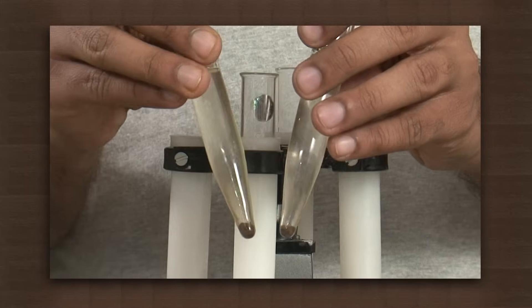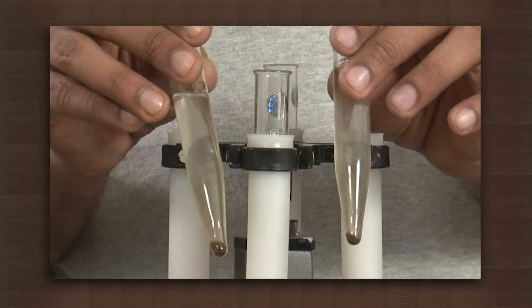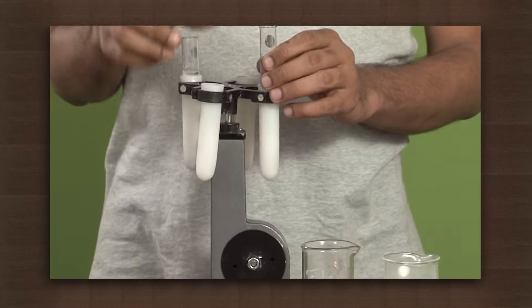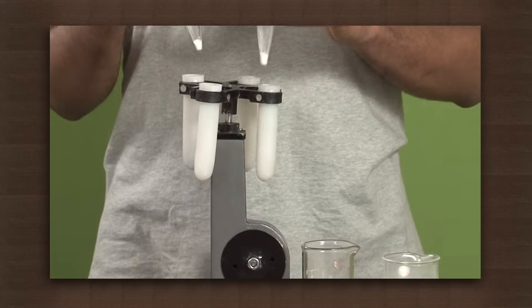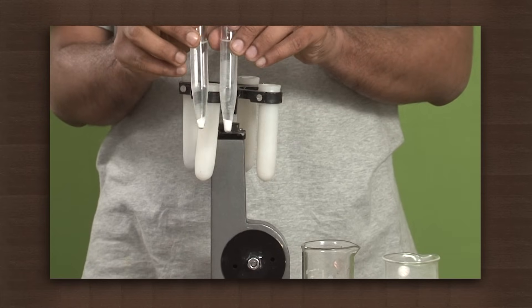We see mud particles and white precipitate have settled in each of the test tubes. This is the process of centrifugation.